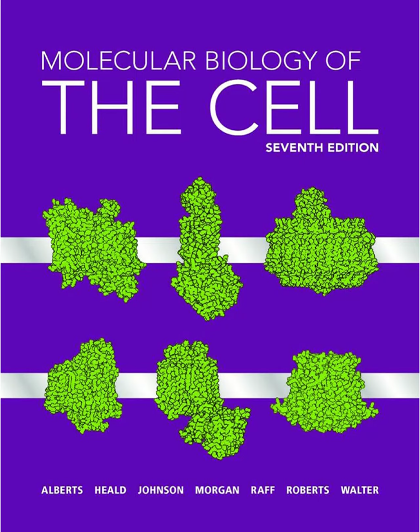The reflection creates what's called an evanescent field. It's an electromagnetic field that penetrates a very short distance, typically only 100 to 200 nanometers beyond the glass surface into the sample. So only molecules extremely close to the cover slip get excited. Exactly. Anything deeper in the cell is effectively invisible, because the evanescent field doesn't reach it.